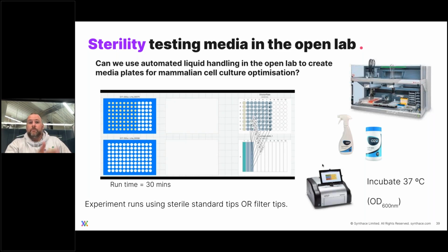After we generate these plates, either with the sterile filter tips or the sterile standard tips, the plates were covered and then incubated at 37 degrees, whilst periodically measuring absorbance at 600 nanometers to see if there was any potential contamination of the media.